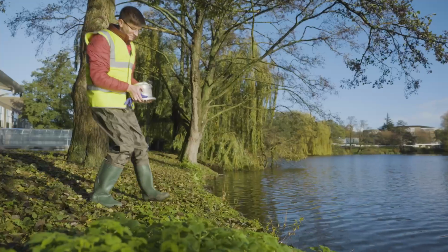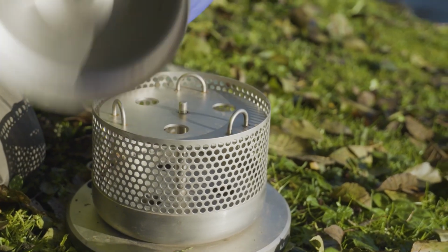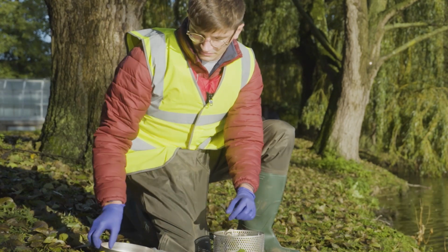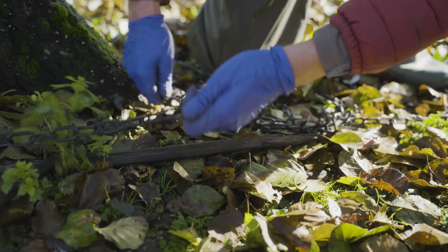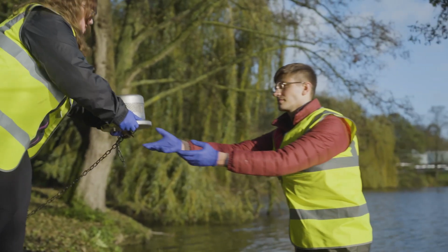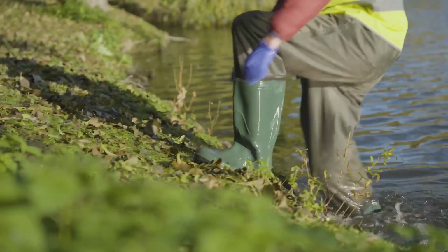Passive samplers, such as chemcatchers or POCIS, provide you with an average concentration of a chemical over time. Like autosamplers, they're a good option where concentrations of a chemical vary significantly over time. When using a passive sampler, you must first choose a suitable place to leave the sampler to prevent theft and human or environmental disturbances. Depending on the contaminant being studied, a suitable receiving phase disc should be chosen. Place the sampler in the water body, attached securely and protected from debris or from being swept away, ensuring it's placed somewhere it will remain submerged.